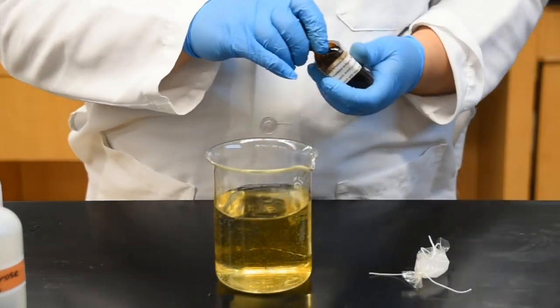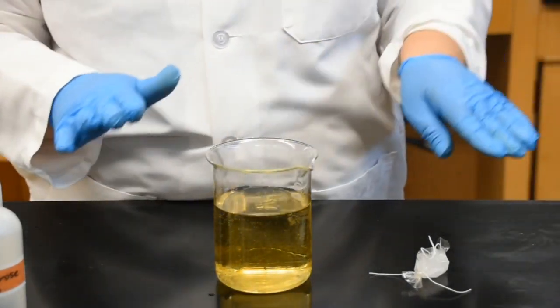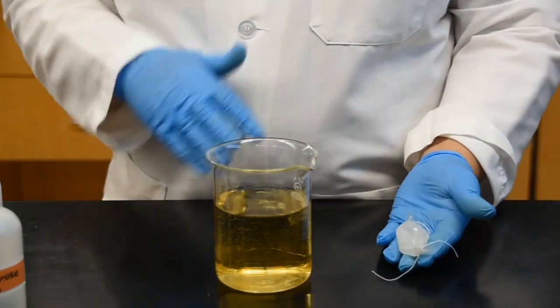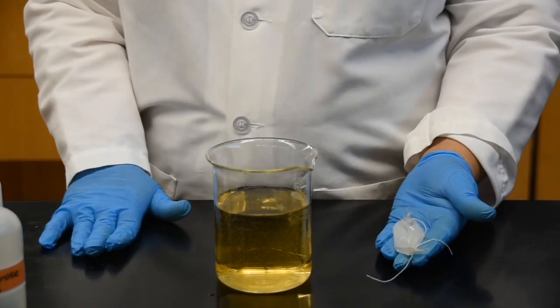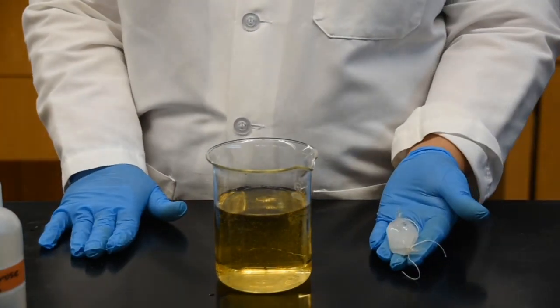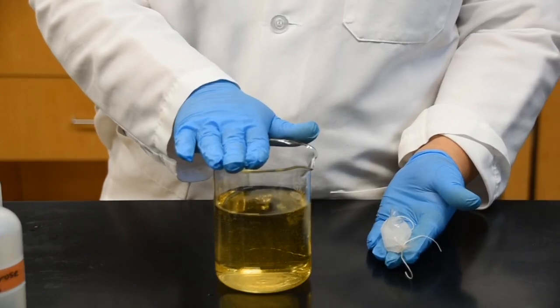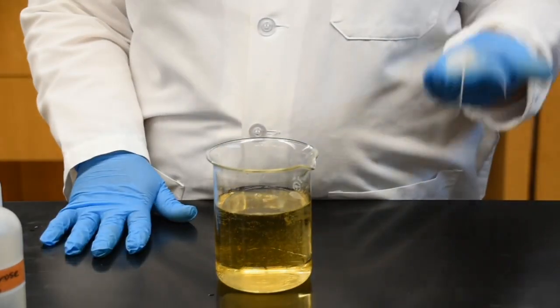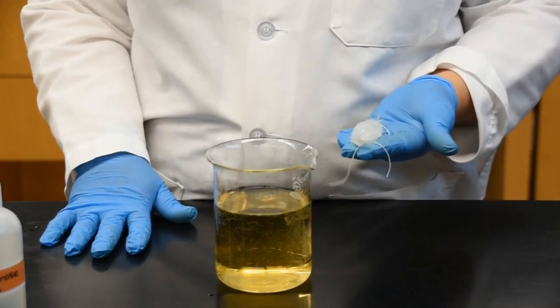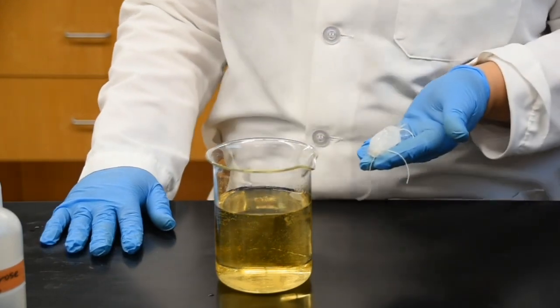Now, if your Lugol iodine comes into contact with starch, it doesn't matter what condition it is in, then the color will change to bluish black. Because Lugol iodine, the yellow solution, is an indicator for starch. And through this interaction, the color of the starch will change to bluish black. Or I should say the color of the indicator changes to bluish black.